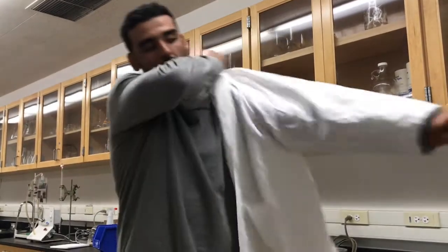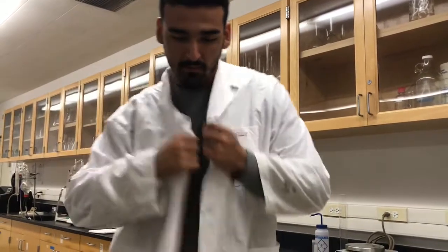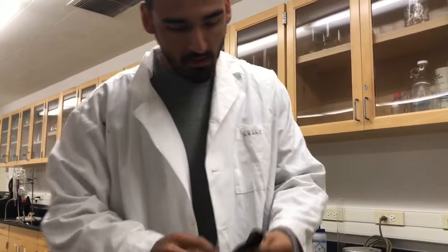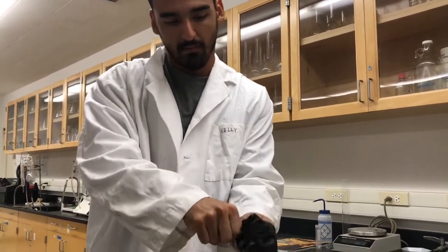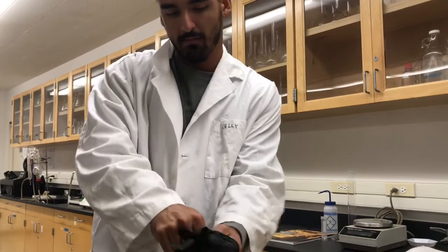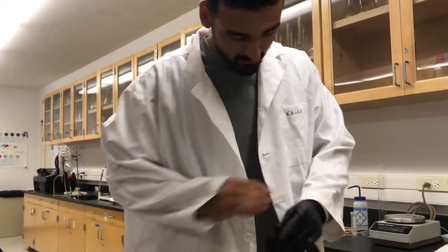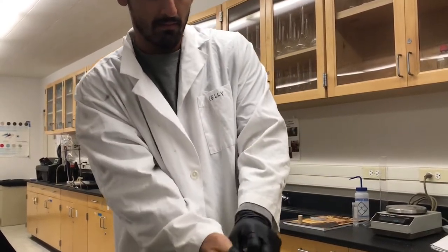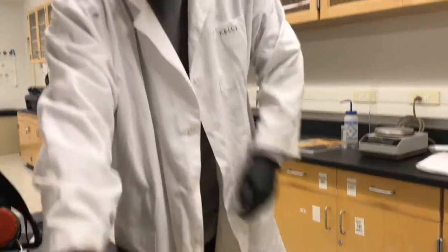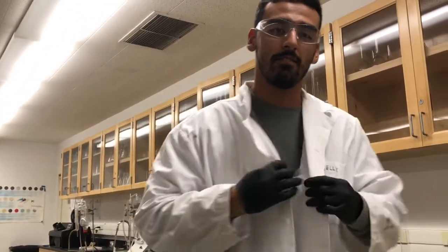And last but not least, you'll need a 2XL lab coat, some gloves, and some glasses. Safety is the number one thing we teach here at Fresno State.